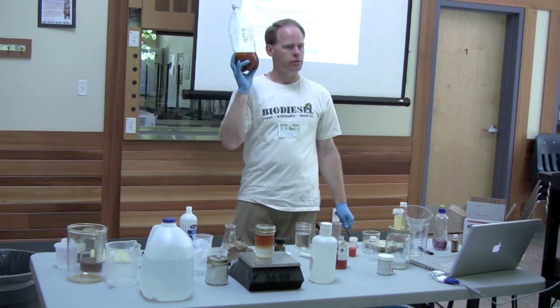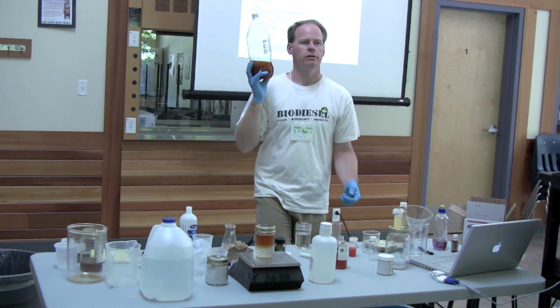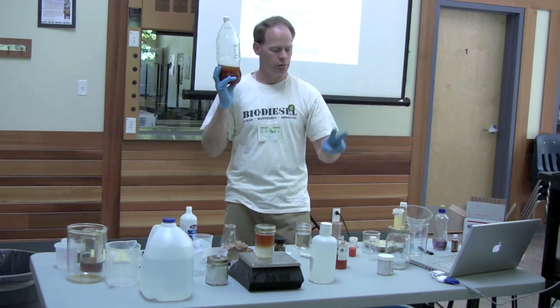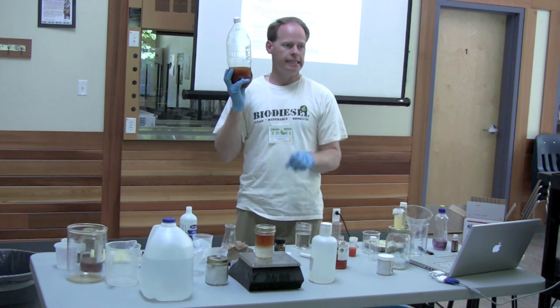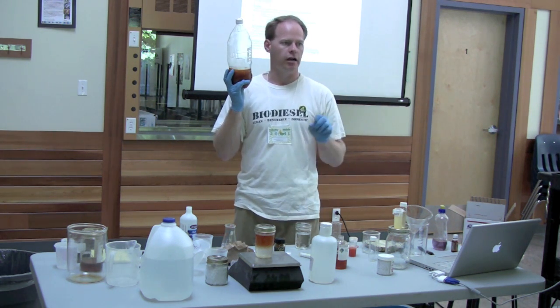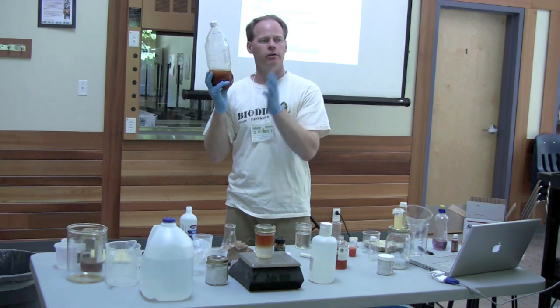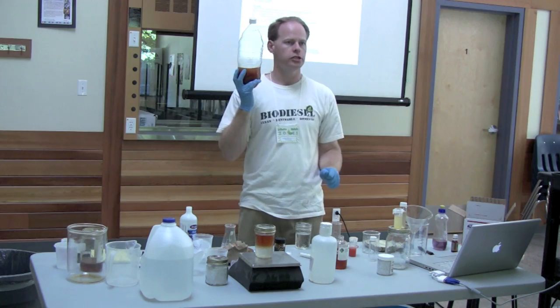What happens if this doesn't react? What happens if it didn't go well? What could have gone wrong? Number one, double check your math. Number two, double check your methanol. Methanol can go bad. It loves to absorb water from the air. And water in methanol means water in oil. Water in oil means unreacted biodiesel. So this is one thing you can check.